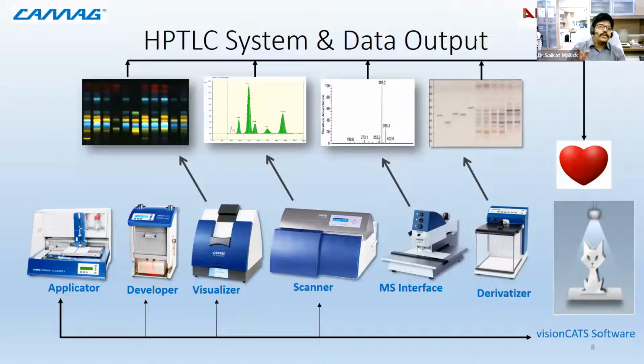And then finally you have the TLC MS interface. These two are additional information providing equipments. The first one is the MS interface. So now directly from the plate you can send a spot into the mass spectrometer and get information. And you have the derivatizer and another instrument known as the bioluminizer, which can be used for your bioactivity estimations, as I told you, bioautography studies.